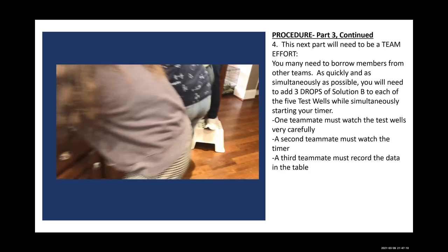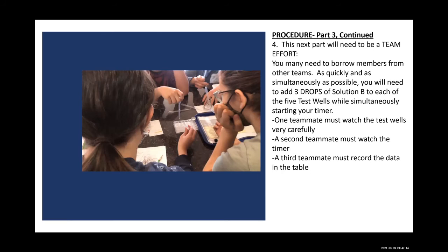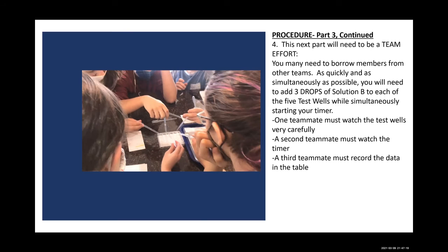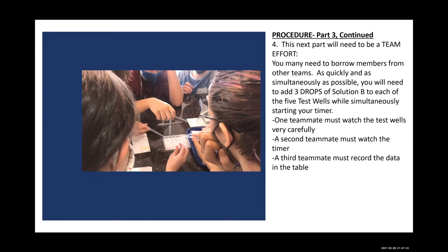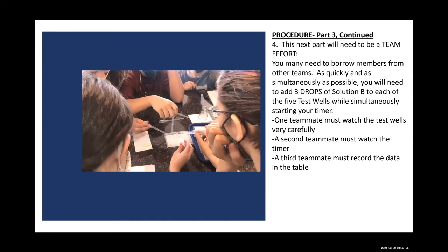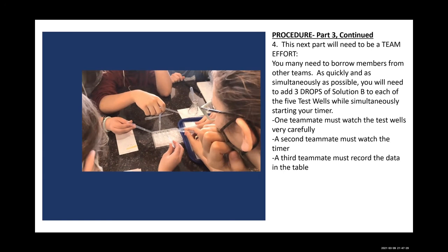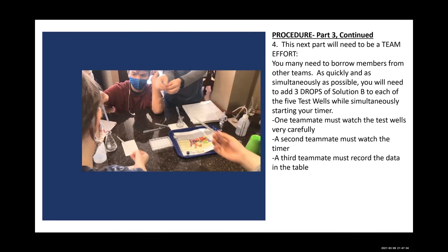Okay, what was that? Make sure there's nothing in the dropper that'll drip. Left, right, please. Alright, get over there. Yes, you can have it. What's the 27? Bring this back out. 1, 2, 3. Okay, no, put them over here on this board.